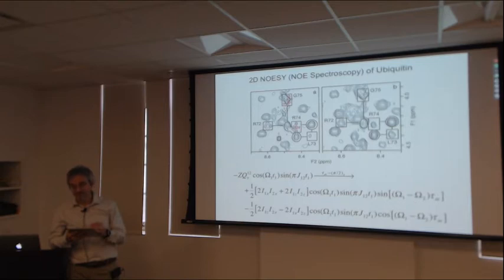Or there could well be a NOESY peak there. They're J-coupled. They might be within 5 Angstroms of each other. I suppose it's possible that they're not. They're really all the way along the side chain. But certainly there's no sign of a NOESY. Up here, you can see there's probably a NOESY peak under there somewhere. It's highly distorted by the zero quantum.